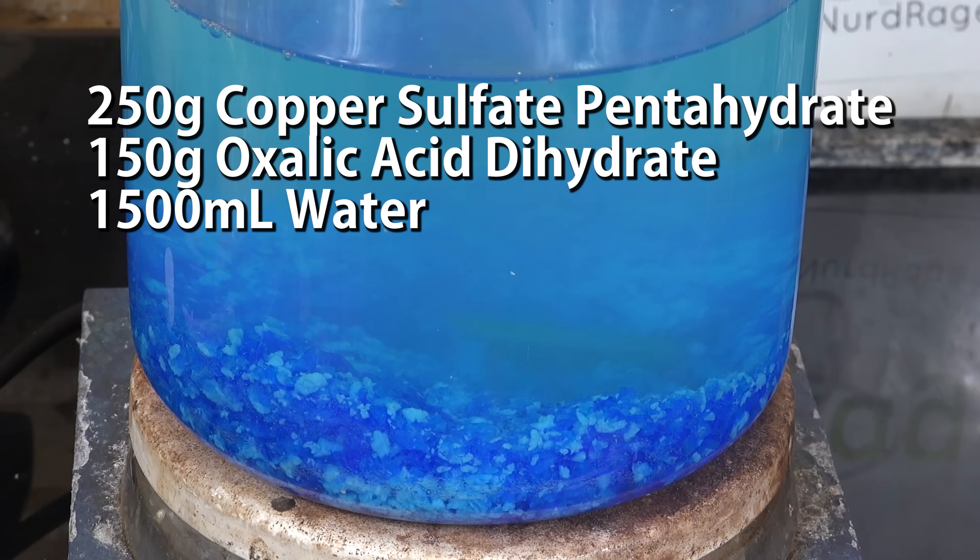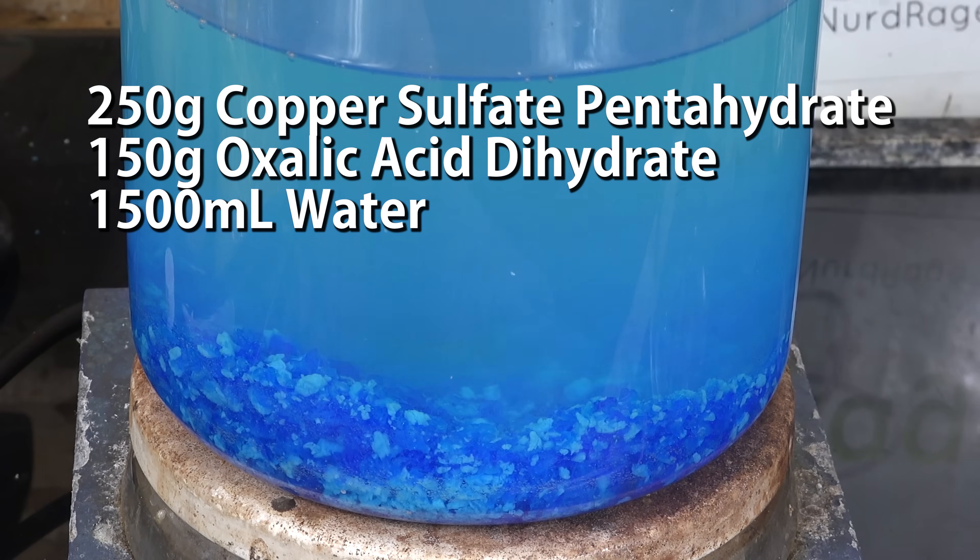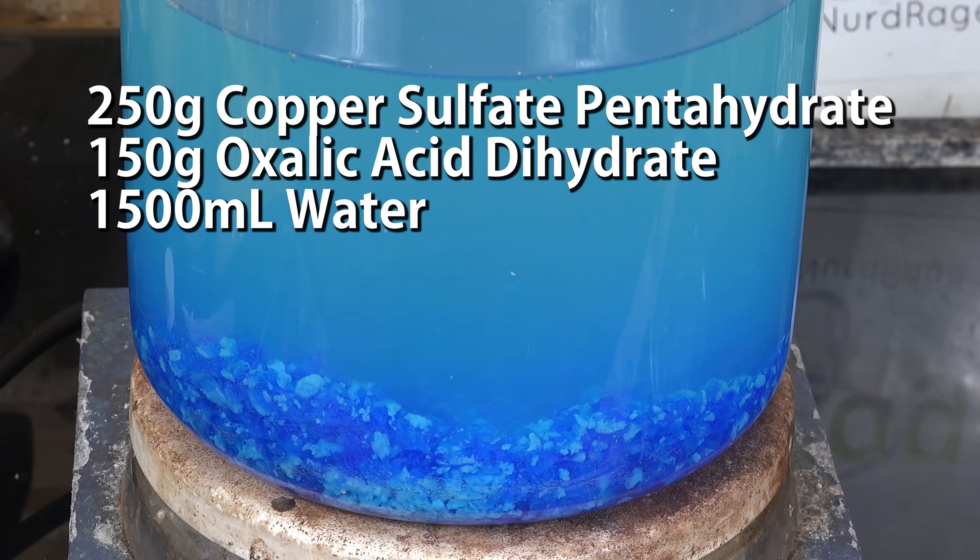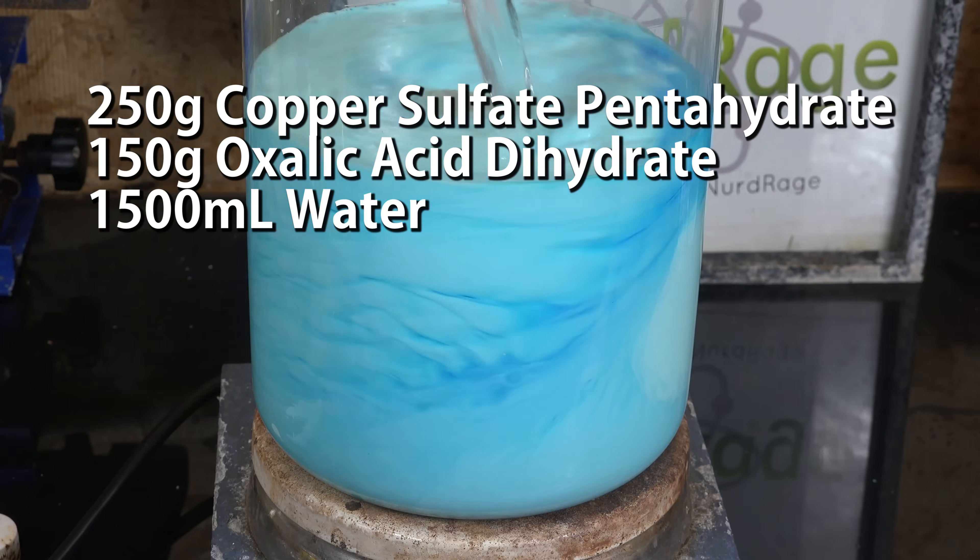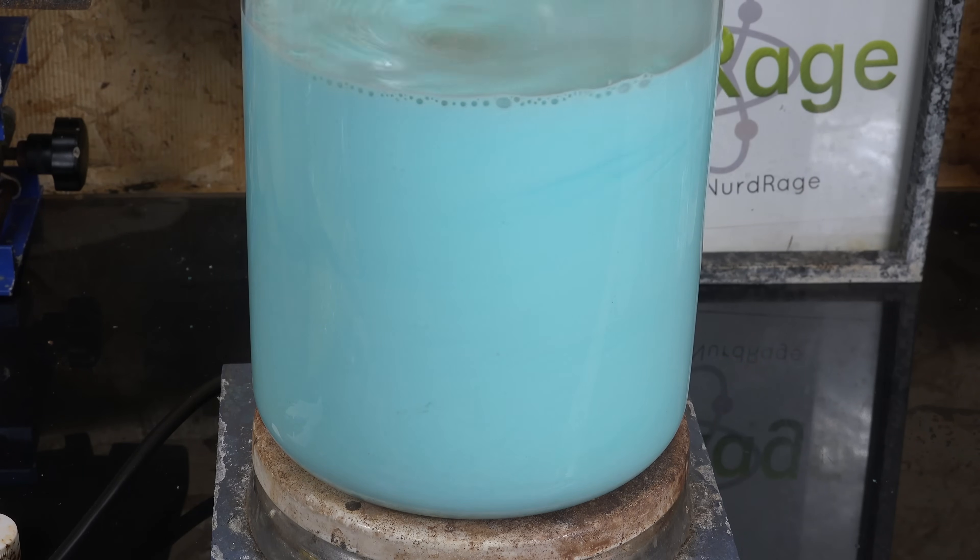So I prepared a mixture consisting of 250g of copper sulfate and 150g of oxalic acid in a total of 1.5 liters of water. Interestingly enough it did work and it seemed to produce the proper precipitate of copper oxalate.